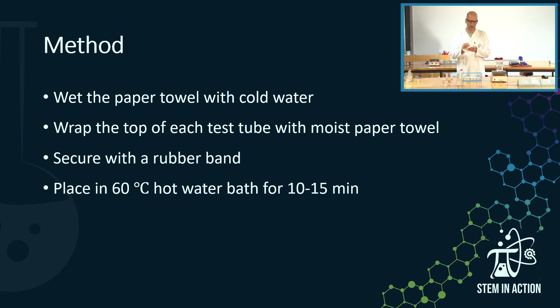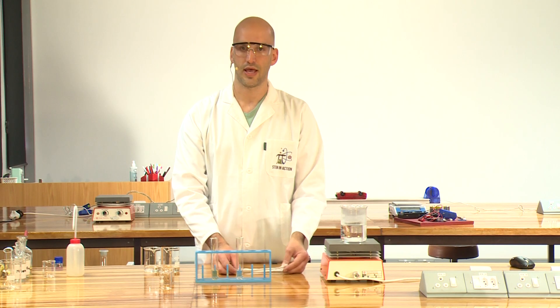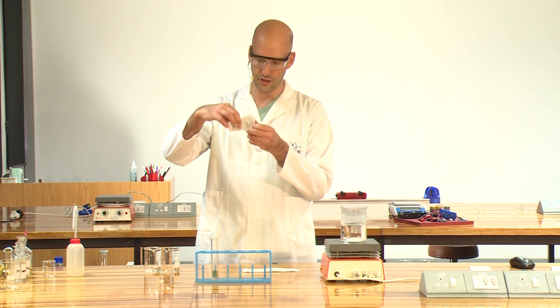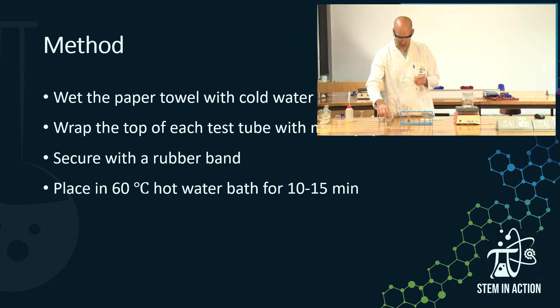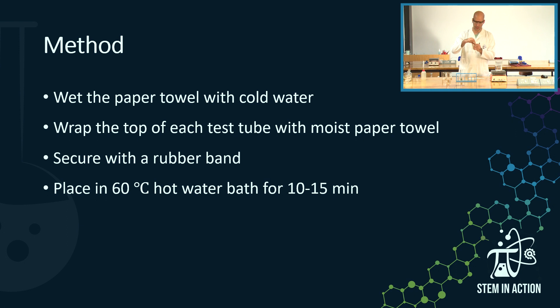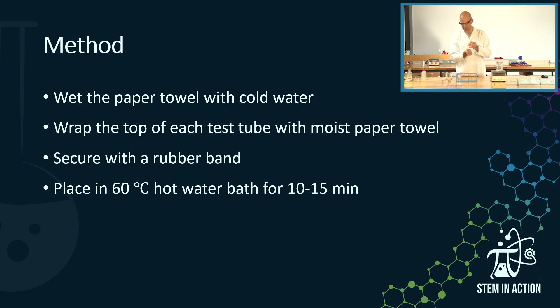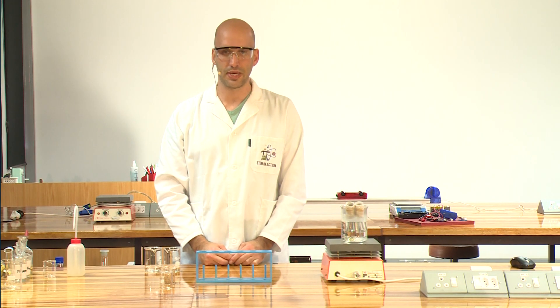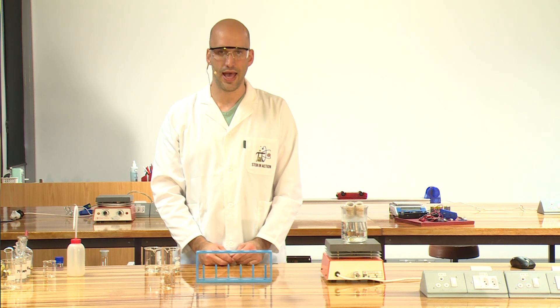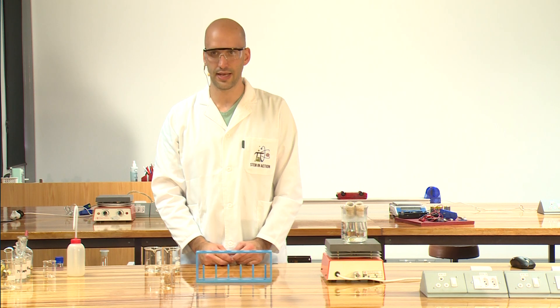I'm grabbing some tissue paper that's already been rolled up, wetting it with a little bit of water, and wrapping it around the top of the test tube. Give it another shake, then grab an elastic band to secure it to the top. I place it into the hot water bath and repeat the process with ester B — these are nice and warm — securing it with the elastic band and placing it into the hot water bath. Inside there, we're going to leave it for about 10 minutes so the reaction can complete.